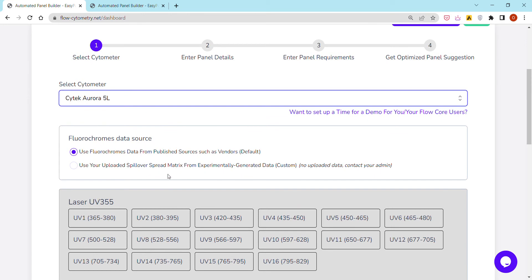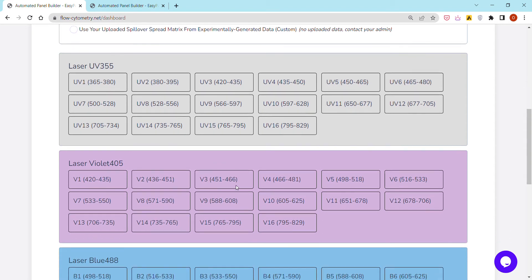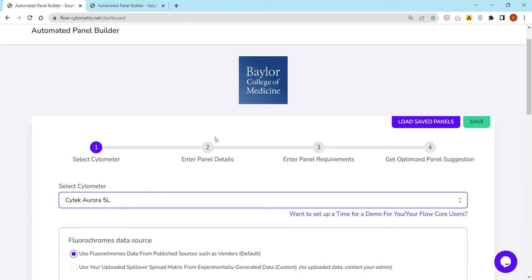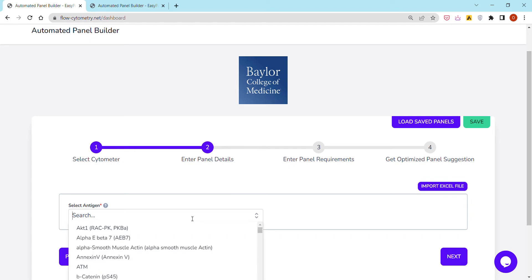After choosing this, it shows me the configuration of the cytometer, including the different lasers and channels or filters, and then I can go next to the next stage.